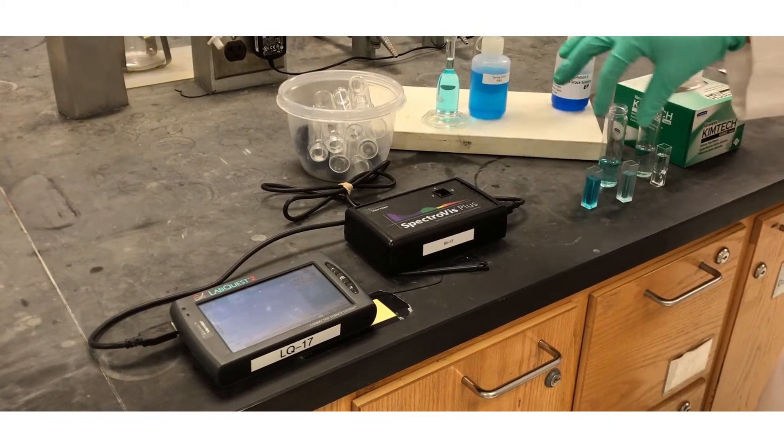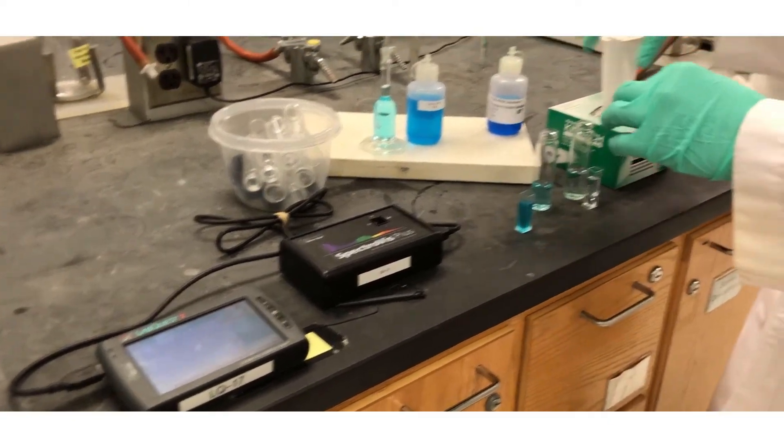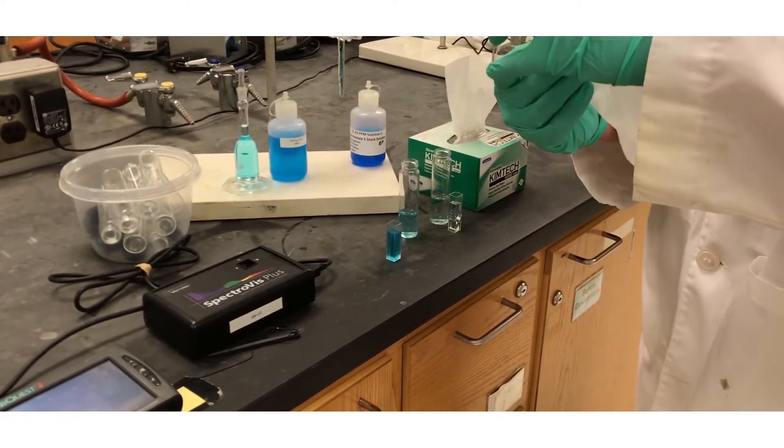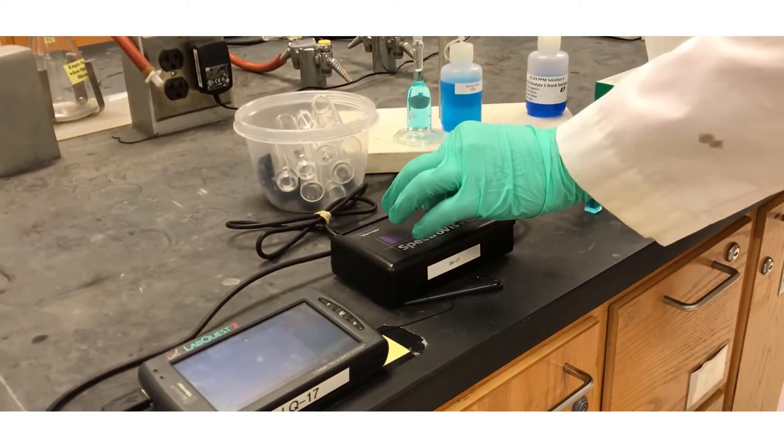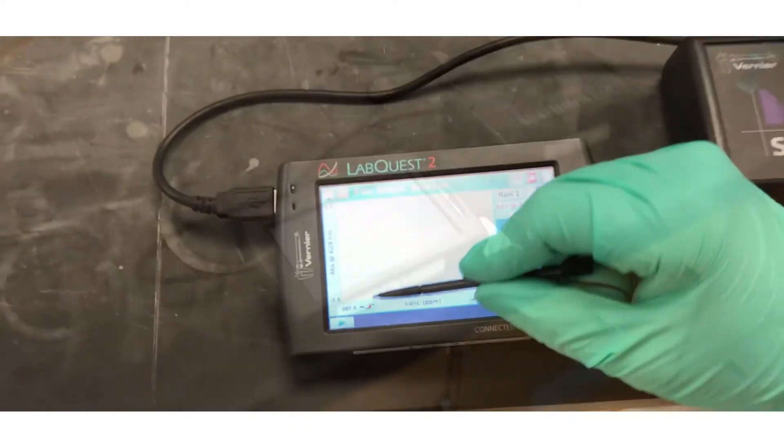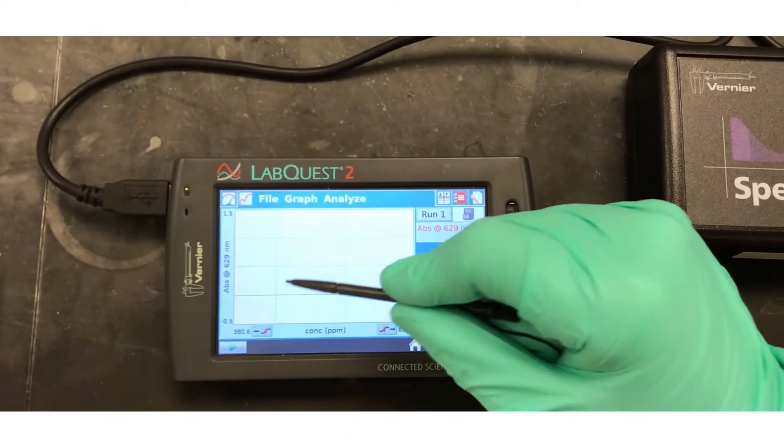Let's check the absorbance of a much more dilute sample. Always wipe the sides of the cuvette with a kimwipe to remove fingerprints and other interferences. Push the green arrow, then the red square to obtain a reading.